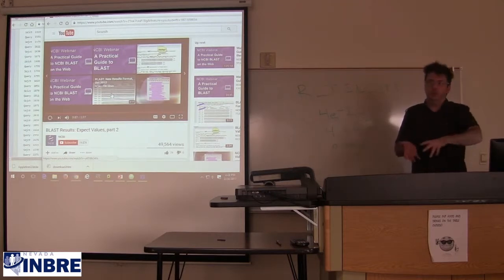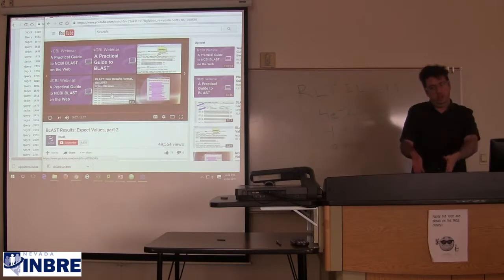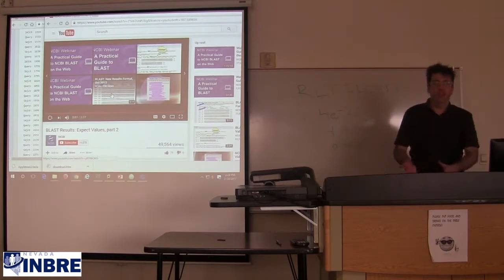So you can combine the statistical information with other sources of knowledge or inferred relationships, and you can use that to lower your thresholds depending on your task.